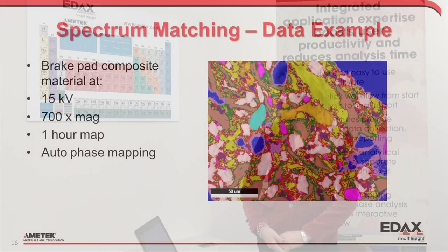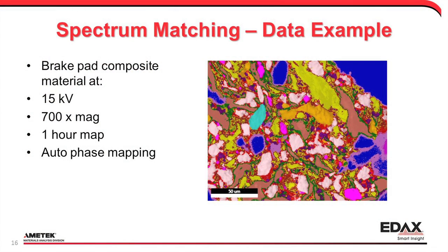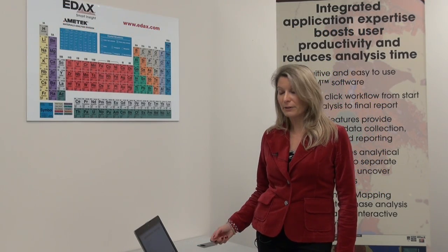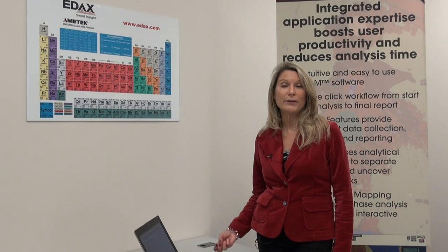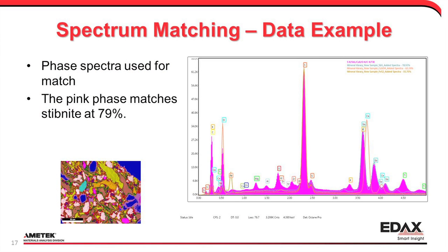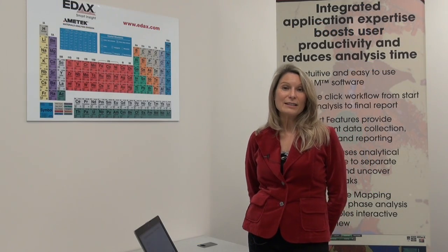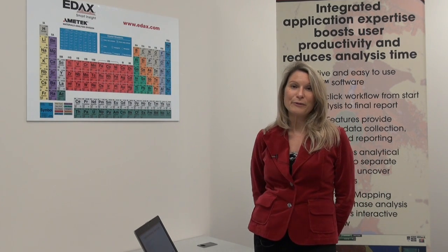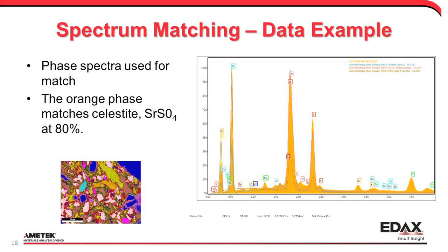We can take the analysis even further by combining it with the power of automatic phase mapping. In auto phase mapping, we ran a high quality map for one hour. At the end of the map, the auto phase selection gave us not just the phase distribution in the image, but also the phase spectra from each of those different areas — all areas with like chemistry. In this case, the pink spectrum was used as the basis for comparison, and we can see that it matches stibnite at 79%. We can continue doing this for other examples, such as the strontium sulfate we also see in the map set.